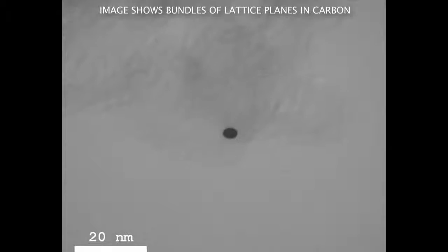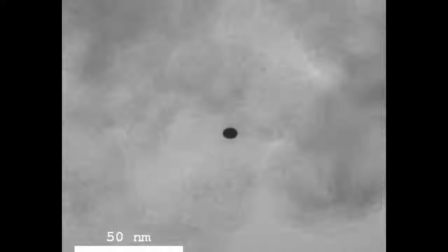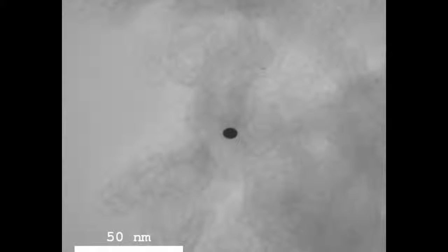Here I put in another sample for you. This is carbon black particles. And they sort of look like some macaroni shaped structures. But what I want to show you here is this phase contrast again. If I change the focusing, then we can see that the effect of this phase contrast will create a contour around each object that's either black or white, depending on which direction I turn the focusing knob.